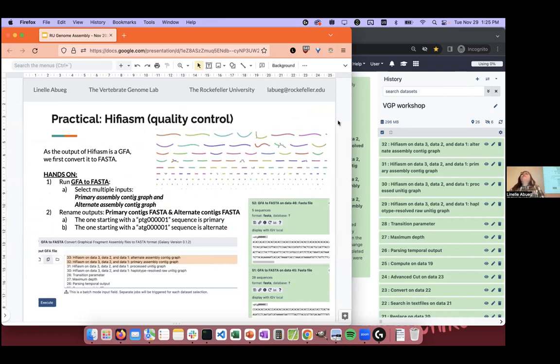Either because sequencing randomly missed some of the regions, or because of bias in sequencing, or because of some problem with the alignments that fail to recognize some overlaps that exist.